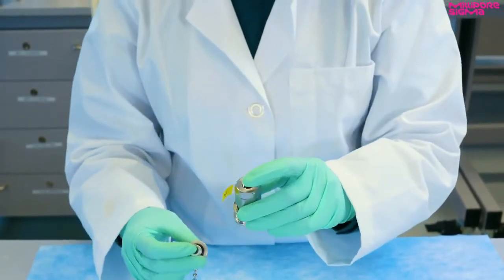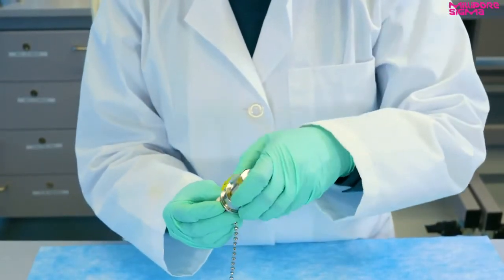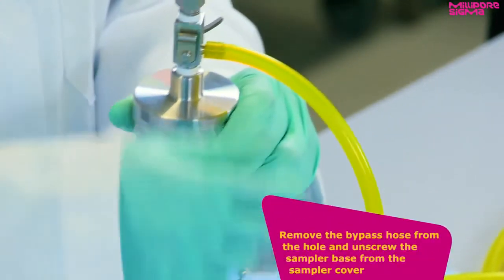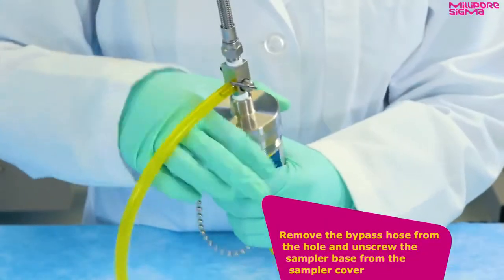Similarly, replace the protective cap on the sampling port. Remove the bypass hose from the hole and unscrew the sampler base from the sampler cover.